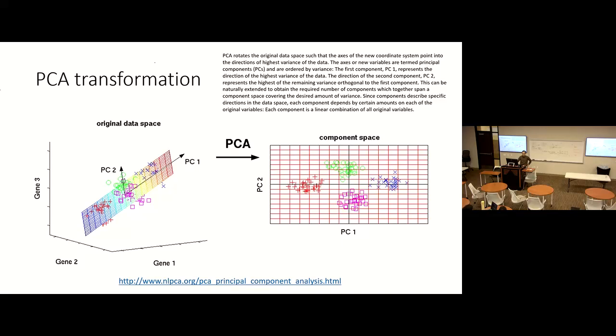These two PCs give you a 2D coordinate system, allowing the data to be projected onto the defined 2D space. Then you have an x-axis and y-axis, displaying the largest variability on the x-axis first, then among the remaining orthogonal directions, you find another angle to show from that perspective.